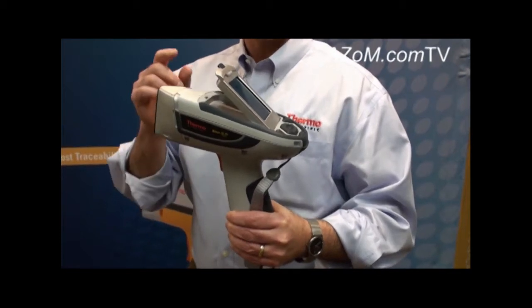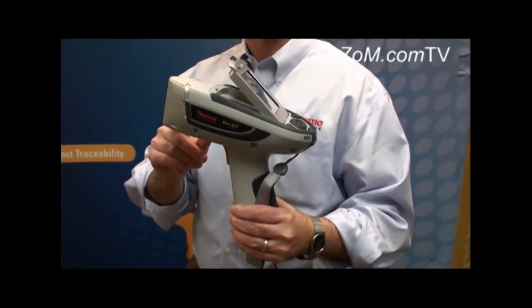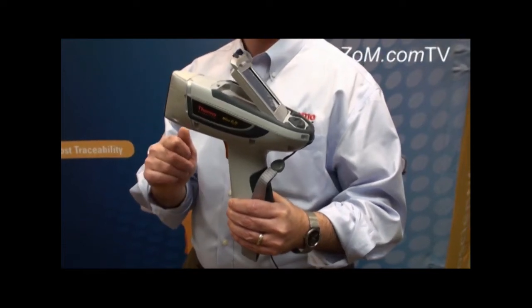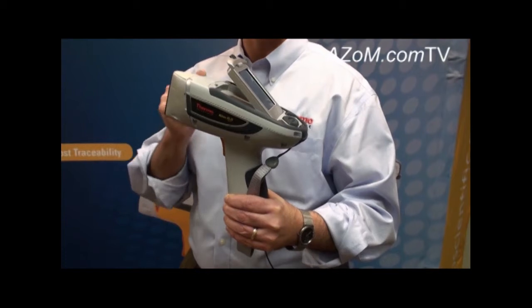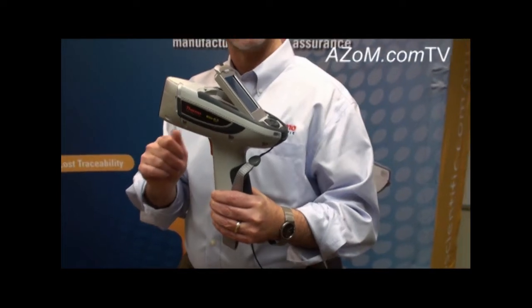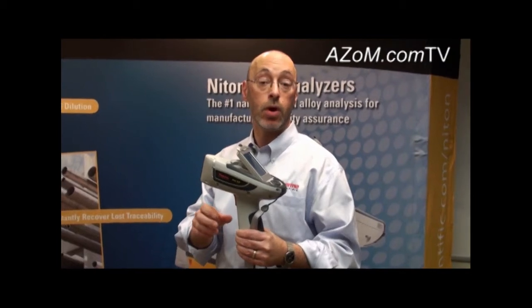The XL3T is the definitive instrument for metal alloy measurement, including the ability to see very low levels of magnesium in metal alloys. It provides the best performance capabilities for mining and exploration, where users want to get down to detection limits below the average crustal abundance for elements within ore bodies around the world.